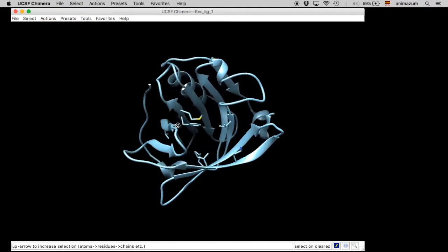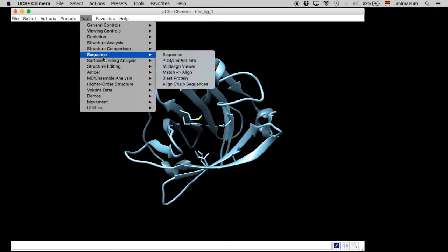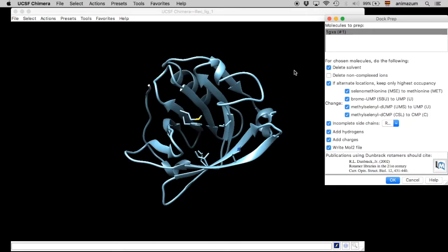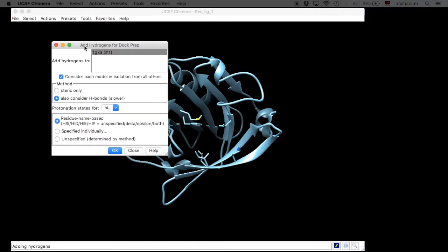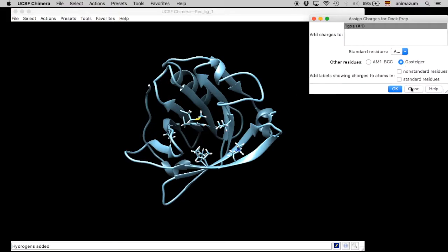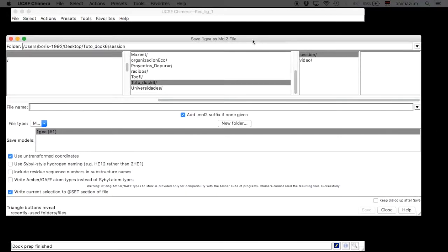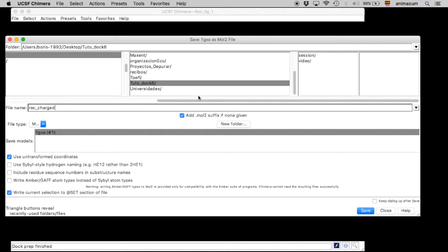Here it is — it is totally alone. Now we are going to prepare this receptor with Dock Prep, using the default configuration. We are going to add hydrogens and charges, and we are going to save it as receptor, named 'REC_charged', in mol2 format.